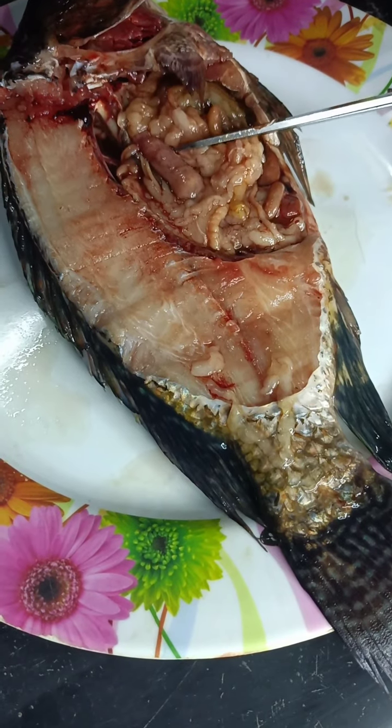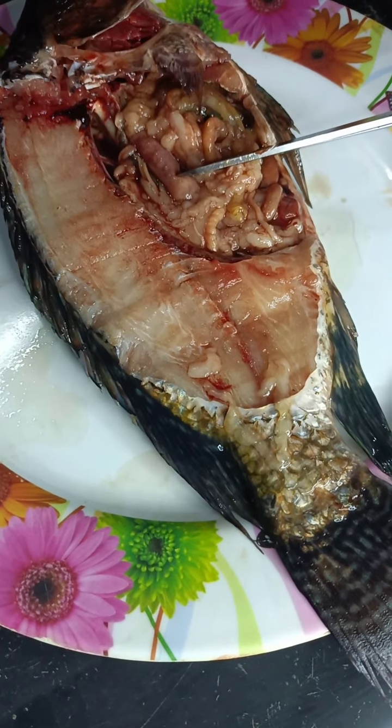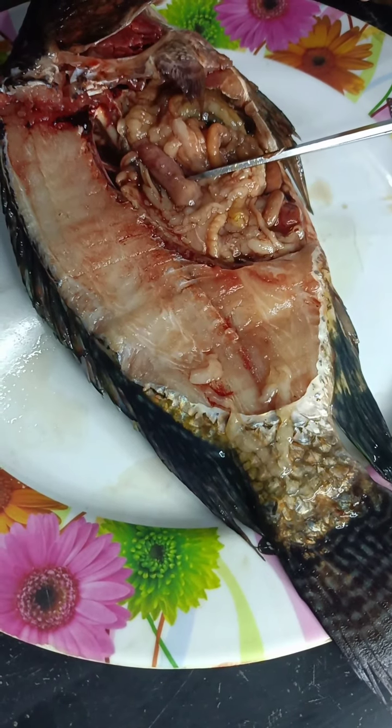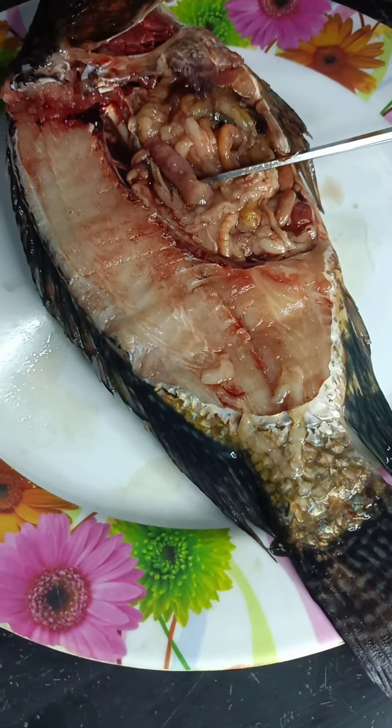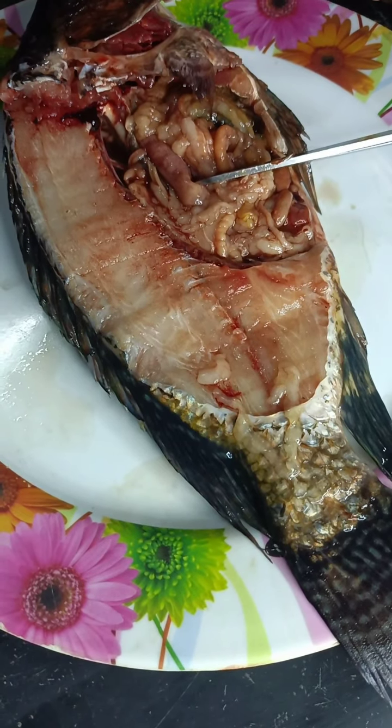Next, the stomach. The stomach and its intestine digest and absorb feedstuff. The intestine is critical for water and electrolyte balance, endocrine regulation of digestion and metabolism, and immunity.